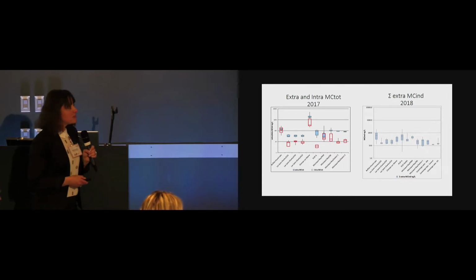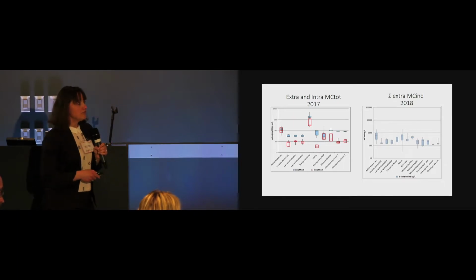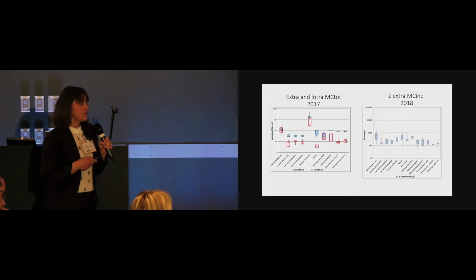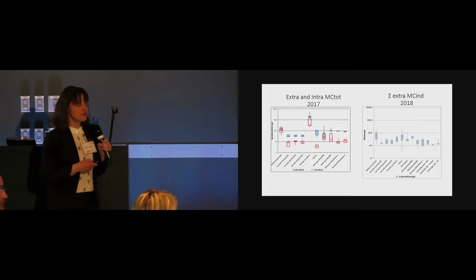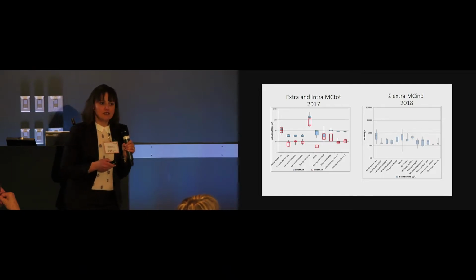Okay. So I'm going to present to you. I spent a couple of weeks analyzing all the results in the lab, and I'm not going to present the graphs which did not work, because I plotted a lot of cyanotoxin concentrations versus nutrients to see if we see a trend or something which looks interesting. But with only the partial analysis that we have so far, it's hard to get a trend, and I didn't see something which was really interesting.